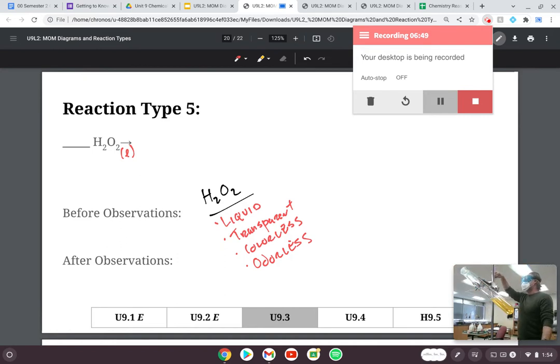So now the next thing I'm going to do is reignite it, and now that it's reignited, I'm going to take the burning flame and put it in there, and I want you to note that it gets brighter, okay? Did you see that it got brighter for a very brief instant?